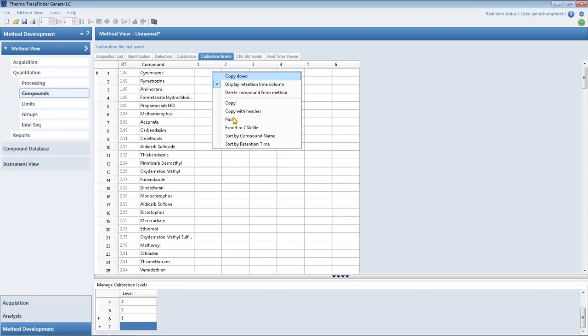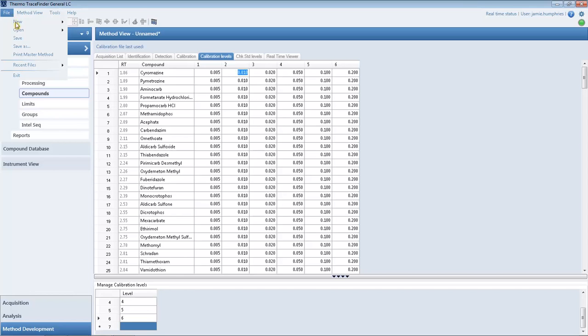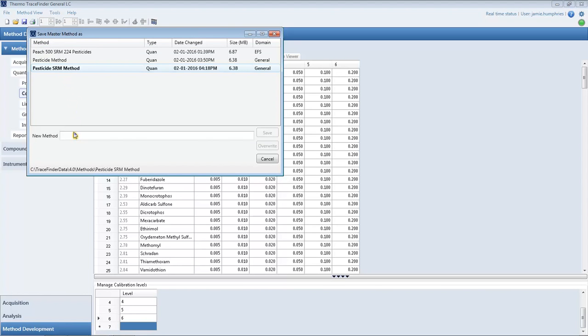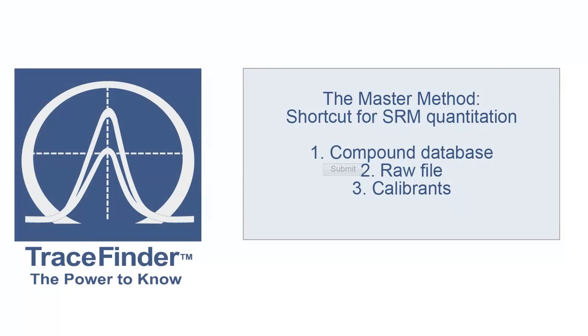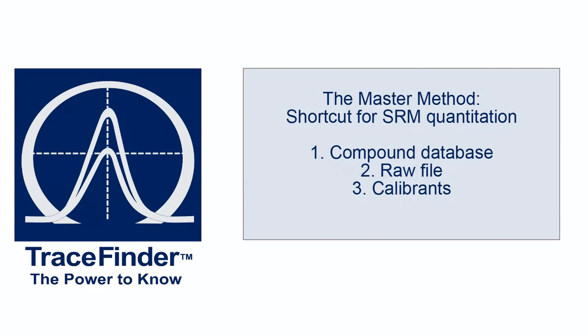Now TraceFinder can automatically quantify the compounds in a sample. Save the master method template to use it later for routine quantitation. This is how we use data importing to quickly set up a TraceFinder master method for selected reaction monitoring quantitation.